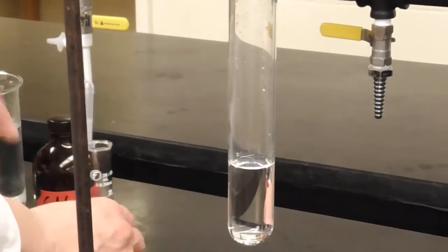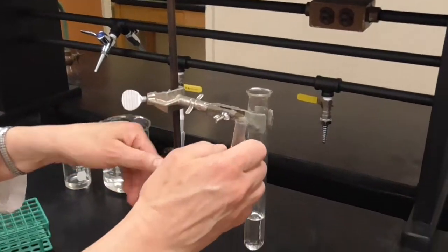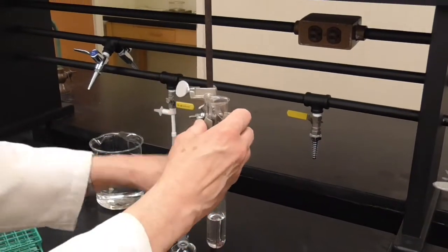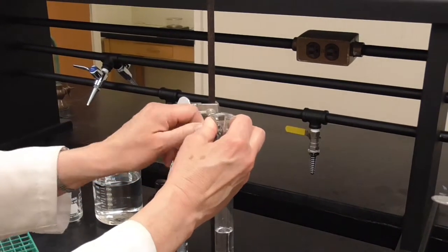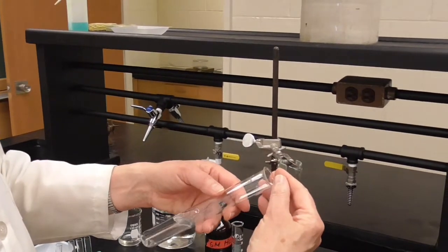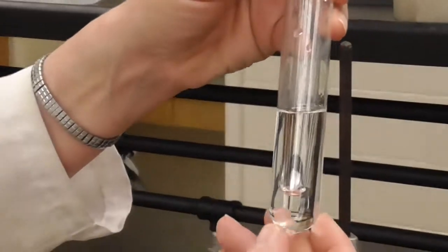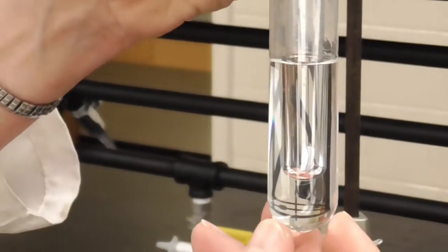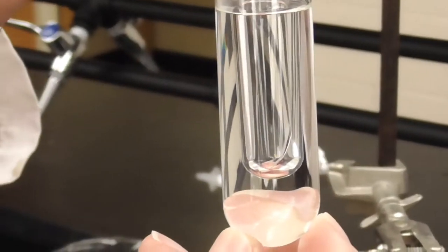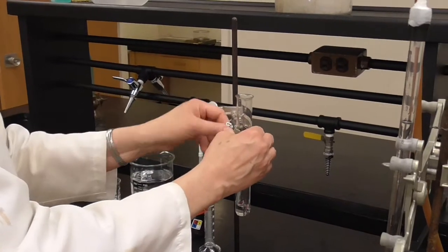And then finally, I'm going to take the small test tube that has the soda can in it, and for safety I'm going to take this off of here so that I can tilt this slightly and just slide it in on the side. And now the small test tube is inside of the large one, inside of the HCl, but there is no HCl inside of the small test tube at this point. So now I'm going to anchor that back onto the clamp.